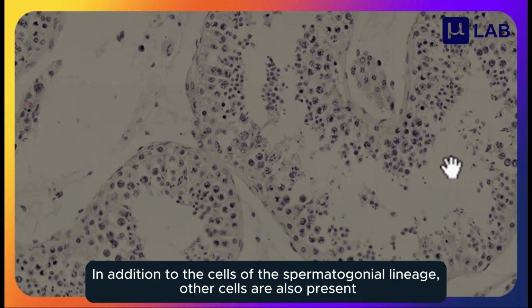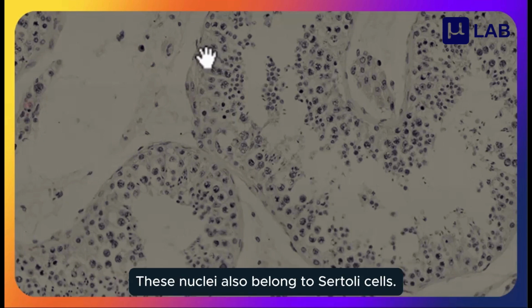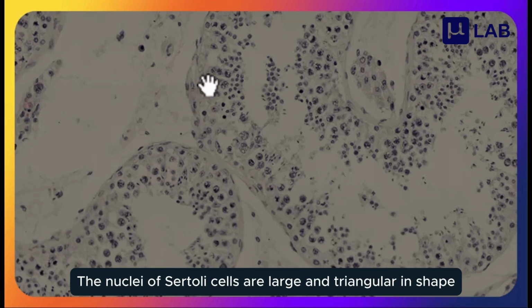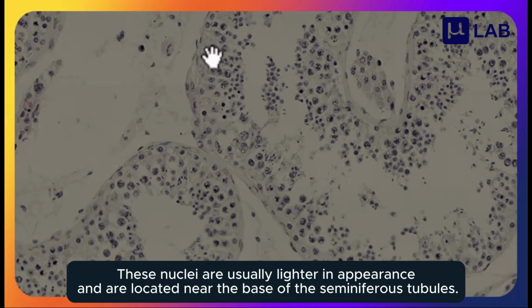In addition to the cells of the spermatogonial lineage, other cells are also present. For example, this cell, or more precisely, this nucleus, is the nucleus of a Sertoli cell. These nuclei also belong to Sertoli cells. The nuclei of Sertoli cells are large and triangular in shape, and they may have a prominent nucleolus in the center, as you can see in this area. These nuclei are usually lighter in appearance and are located near the base of the seminiferous tubules.